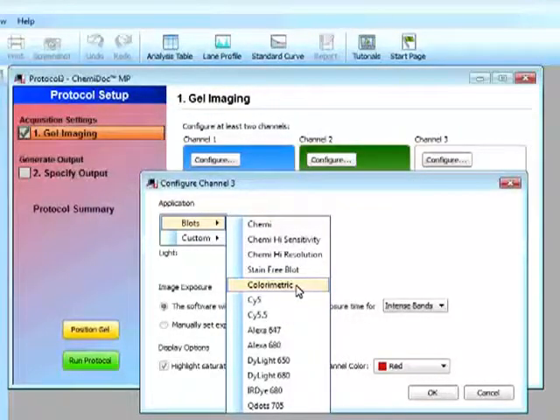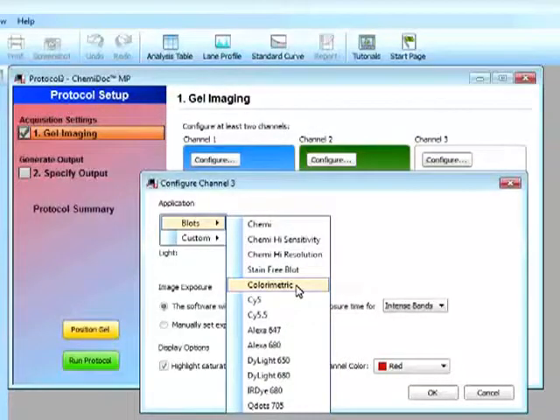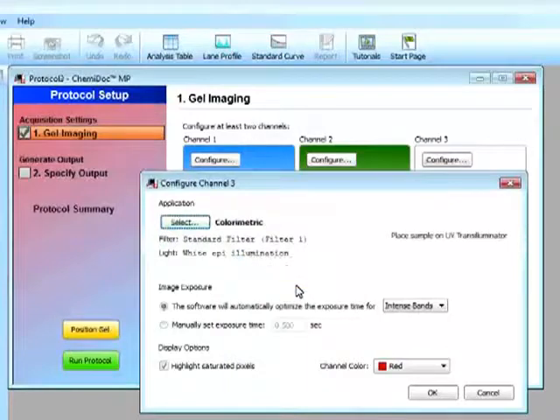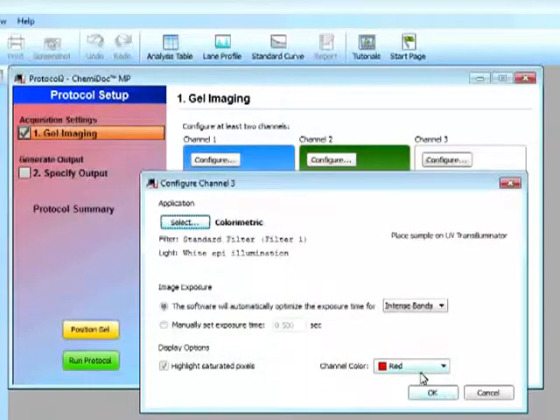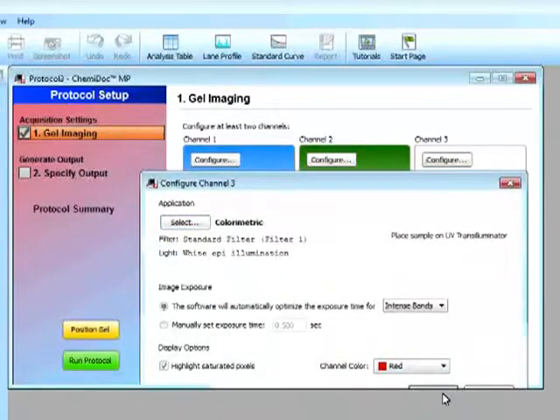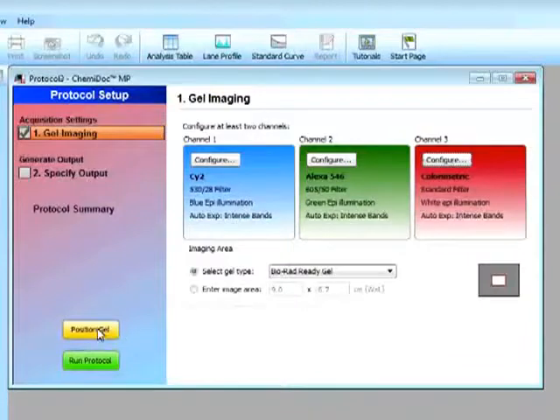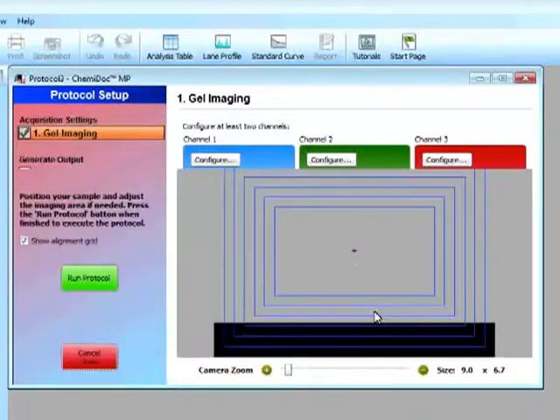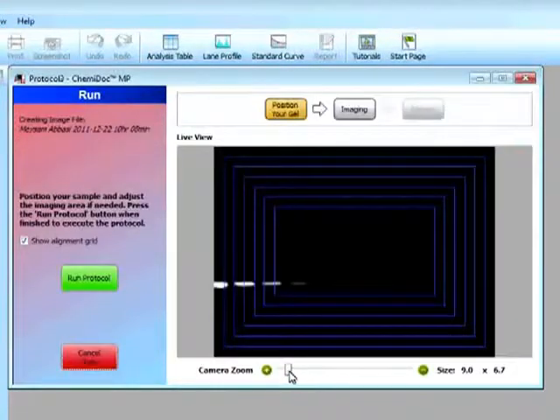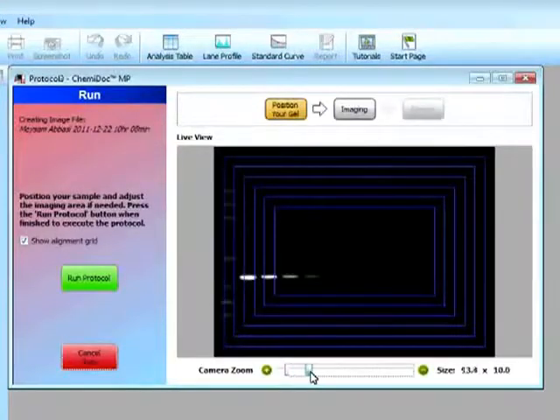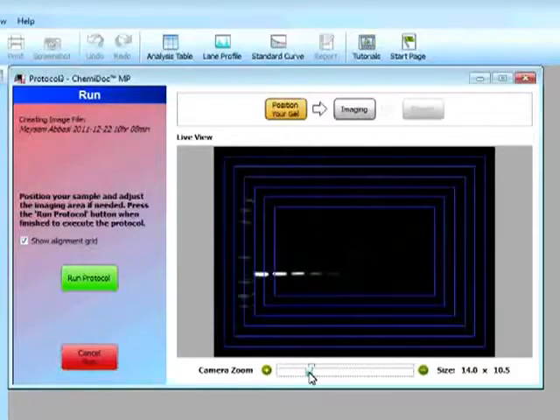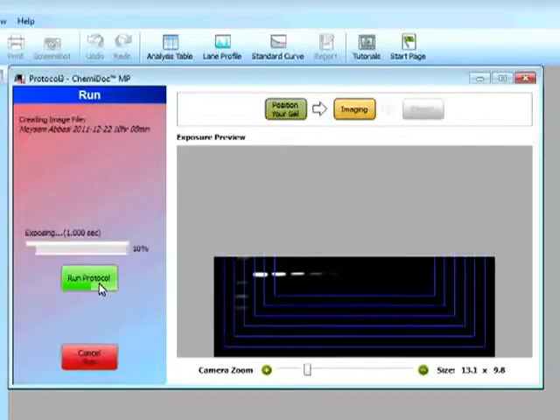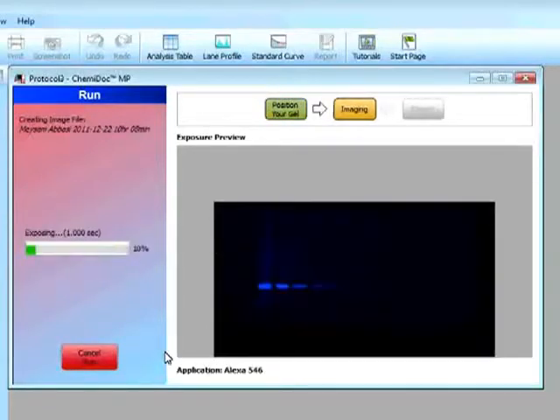So I can compare, basically look at the molecular weight of my target proteins, and then select a specific color, click on OK. Again, we will position our gel, zoom out, and then click on run protocol.